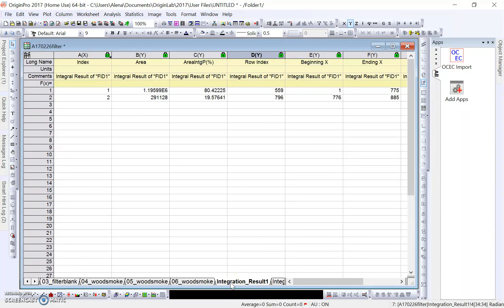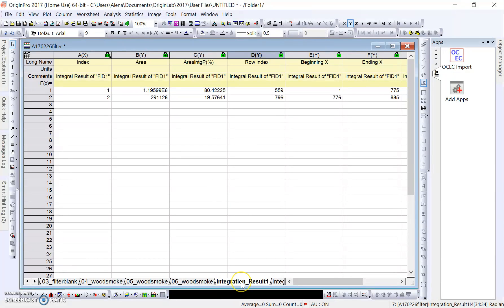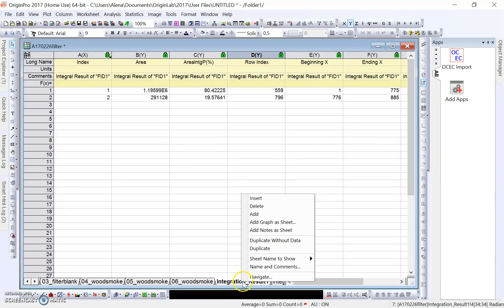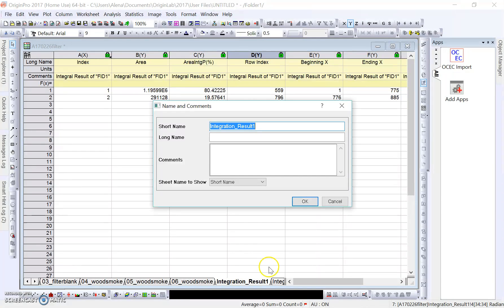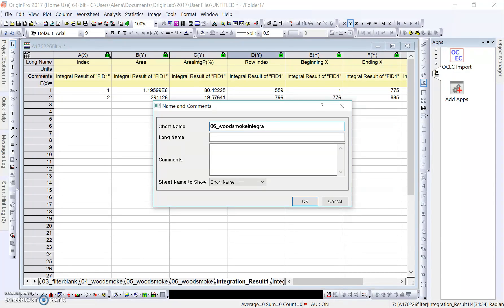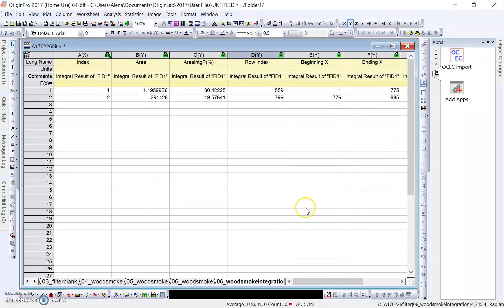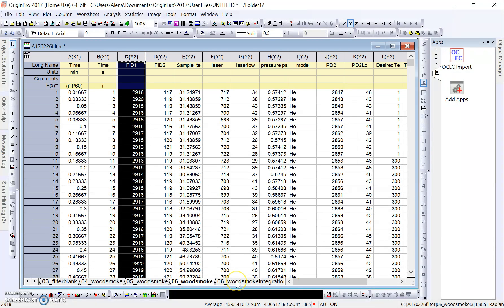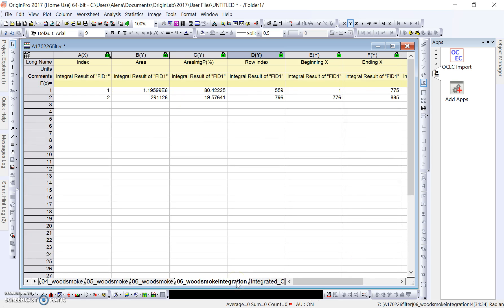A thing to note at this point is we can see that our tab here is integration_result1. It's a good idea to probably rename this right away so that we don't get confused. In this case, it was wood smoke sample 06 that we were analyzing, so we can just label it something like 06 wood smoke integration. Then we'll go OK, just so that we know that it's correlating to this sample that we looked at earlier.